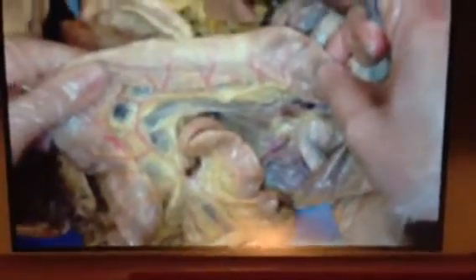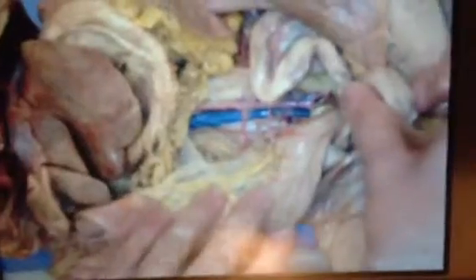Now right here. So then this starts the cecum. And then we have our ascending colon. And then descending colon. And that's about all we can see in the cat. This is the bladder. This is the uterus. Okay, that's it. Okay, now it's our kidney.